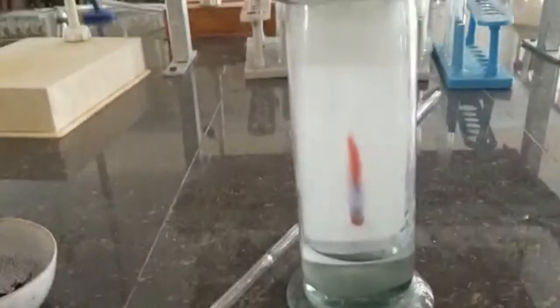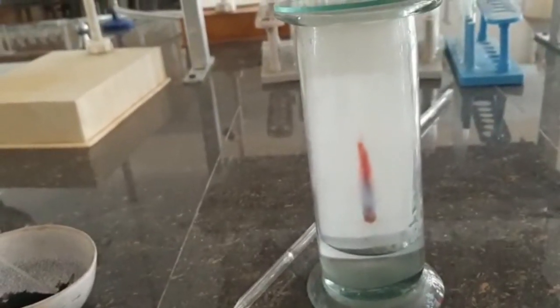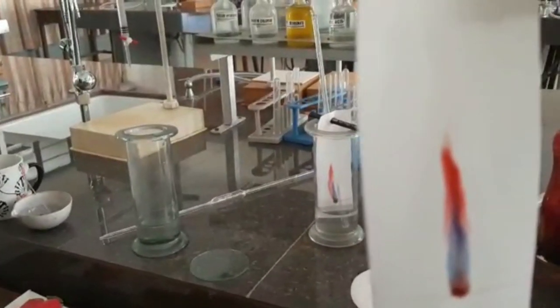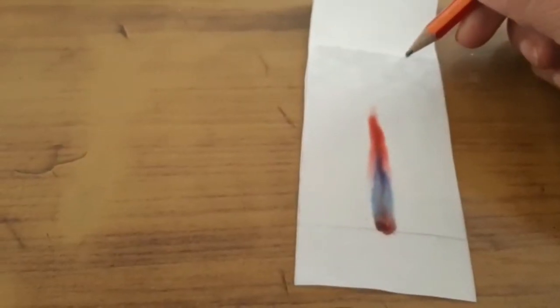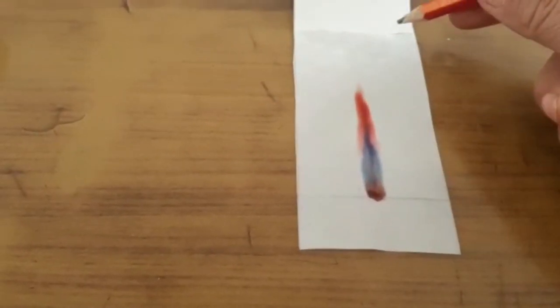Our final product is ready. I am going to remove this from the jar, dry it, and then measure the Rf factor. I will mark this line and measure the distance from the baseline to the line of wetness, which is called the solvent front. The solvent front is the line up to which the solvent moves.